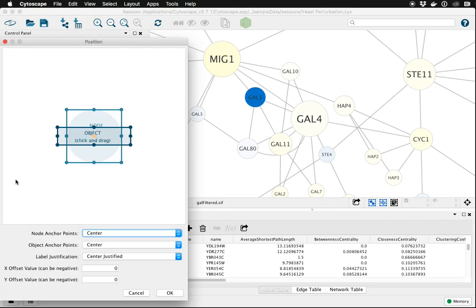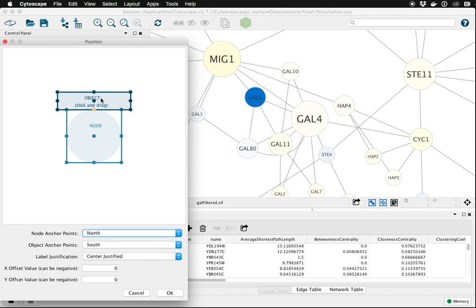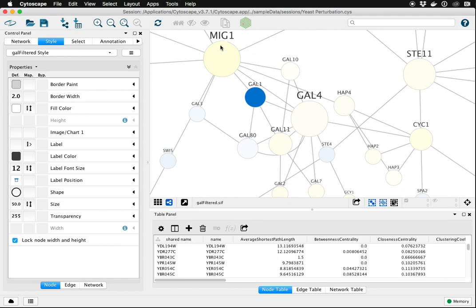Under default we can now change where the label position is relative to the node by just dragging this around. So if we want the label above the node, like so, say okay. Now all of our labels are above the node.